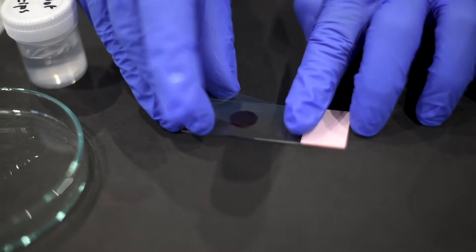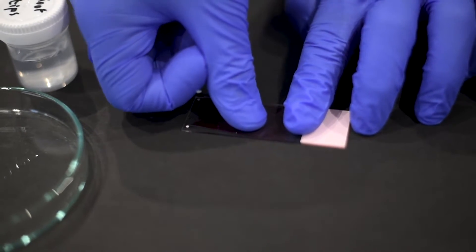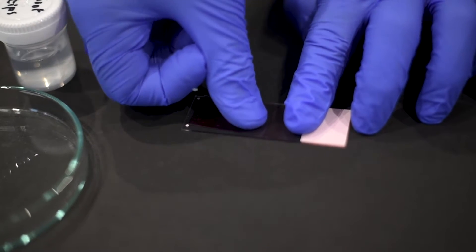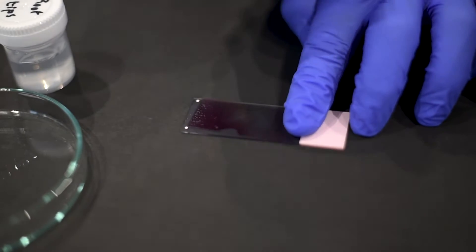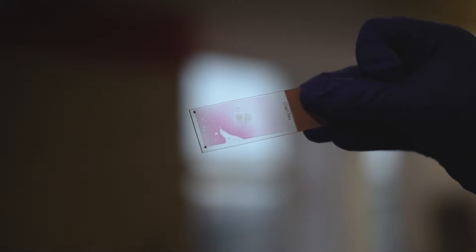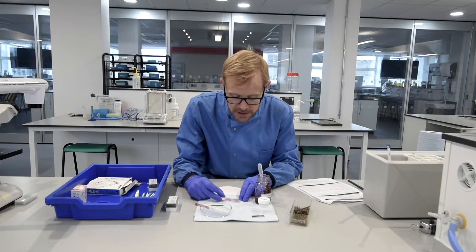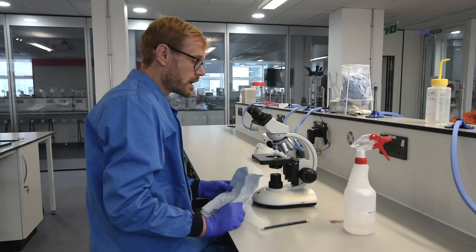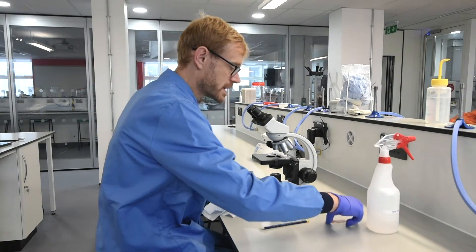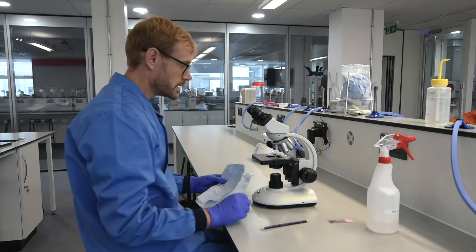We're then going to get a cover slip and put that over the top of the preparation, and gently with our thumb we're going to apply pressure, rocking back and forth. And that's it — it's quite simple, and that is an onion root tip chromosome preparation.